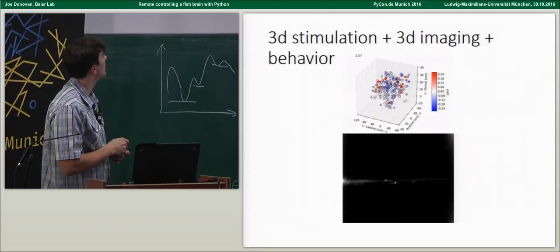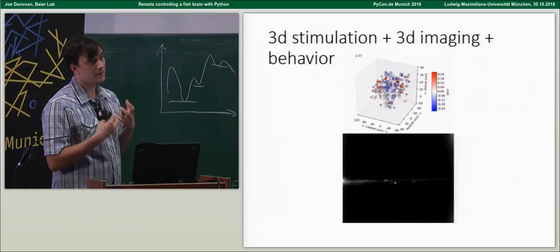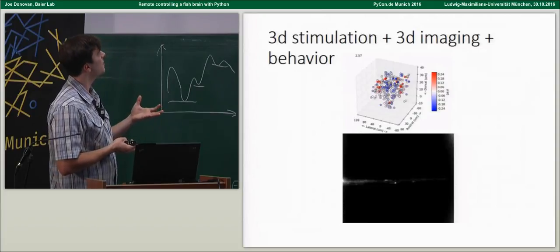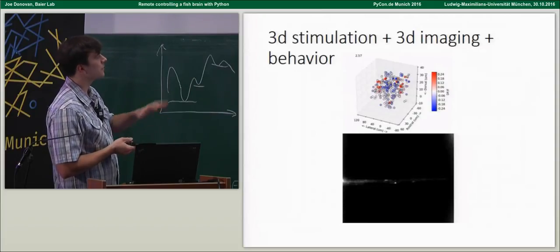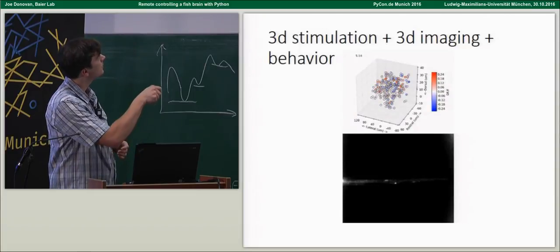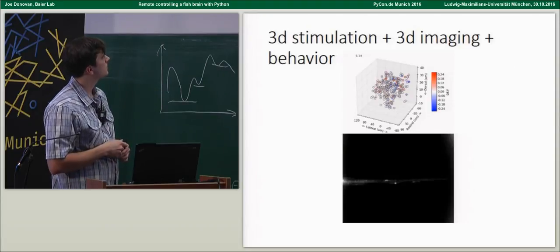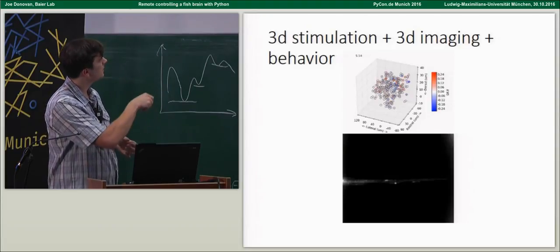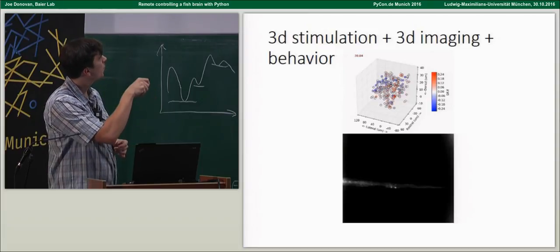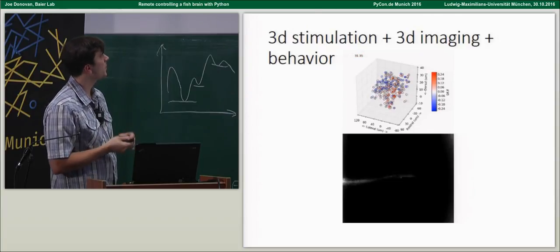And then ultimately, we can use this to find groups of behavioral neurons that when we stimulate them drive steering and swimming behaviors. At the same time, we watch these behaviors and watch many other neurons in the circuit that are involved in the activity. When there's red text up here, that's stimulation. You can see the tail moves. For the first 2 trials, it's a small tail deflection. And then for this third trial here, you can see that there's more activity spread throughout the circuit, and it's a much larger, full swimming behavior.